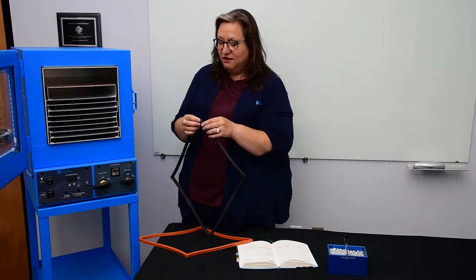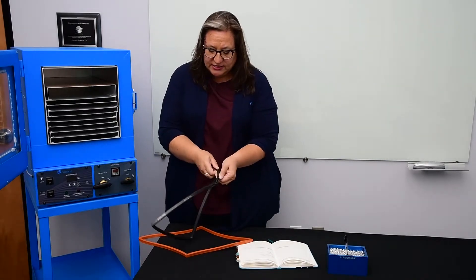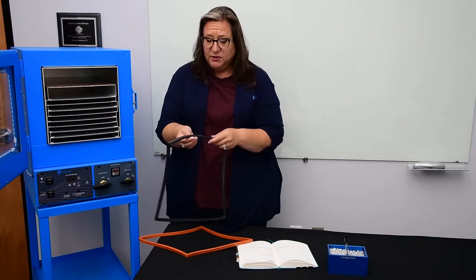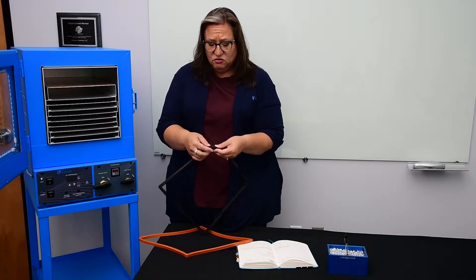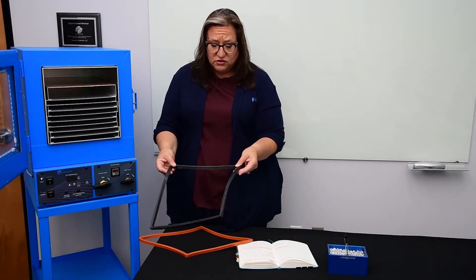To inspect your gasket, you're just going to want to gently separate the gasket and take a look inside, looking for any areas that are obviously thin or even slicing through. That would be in a gasket that's maybe six months to a year old.